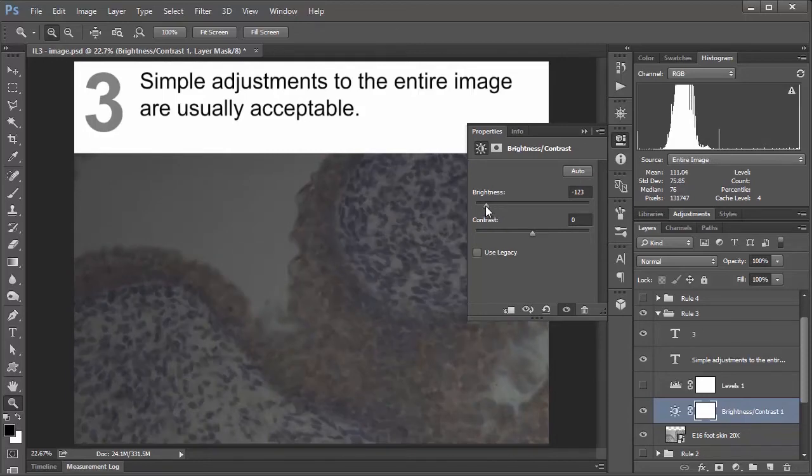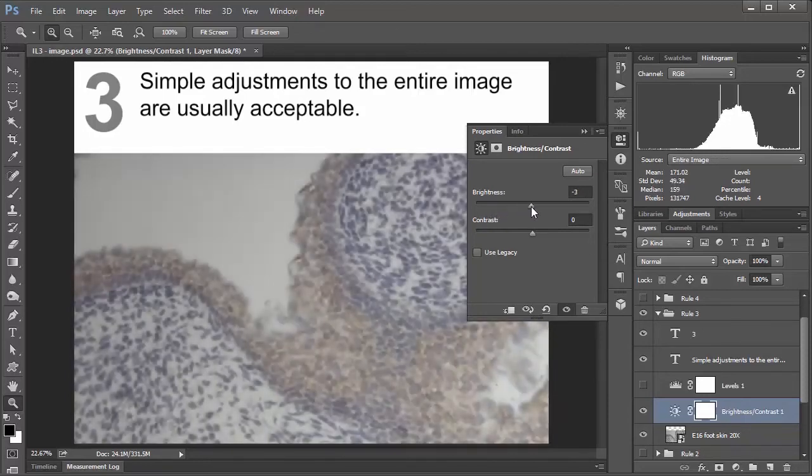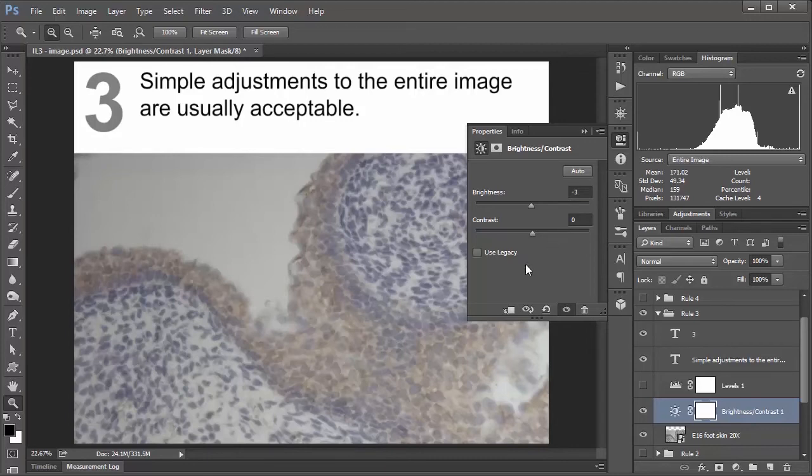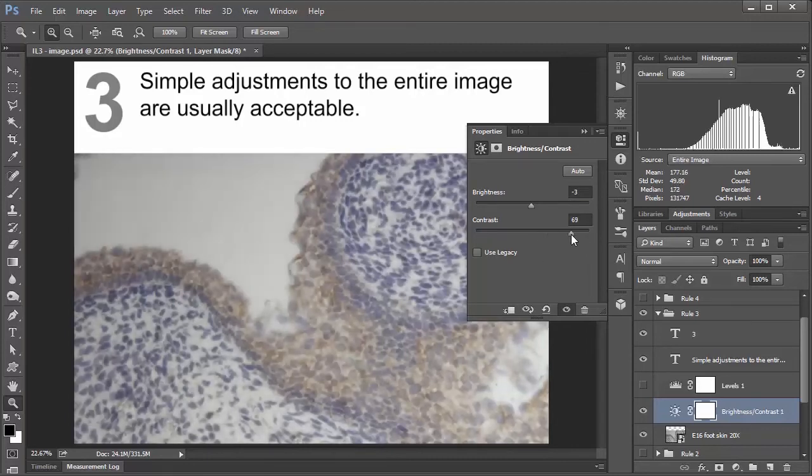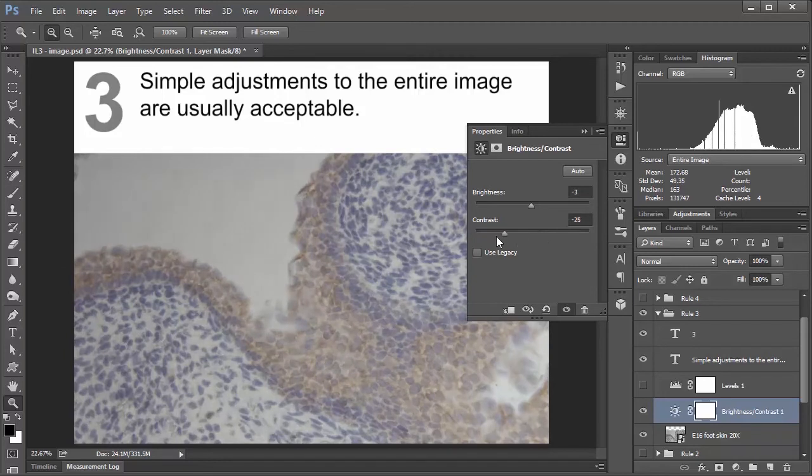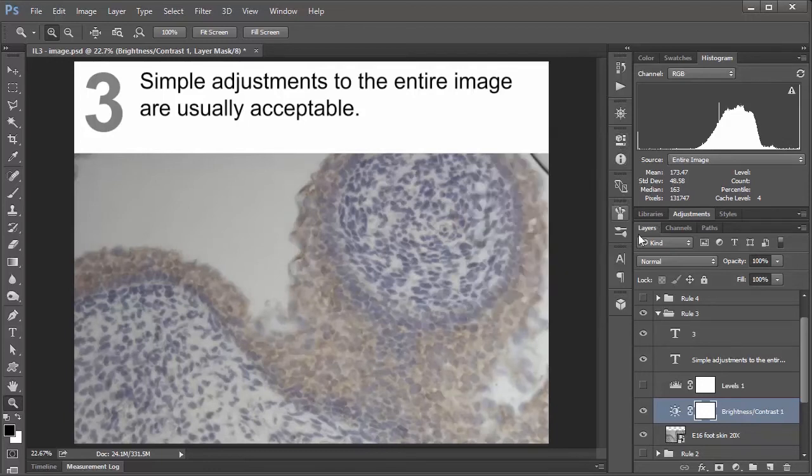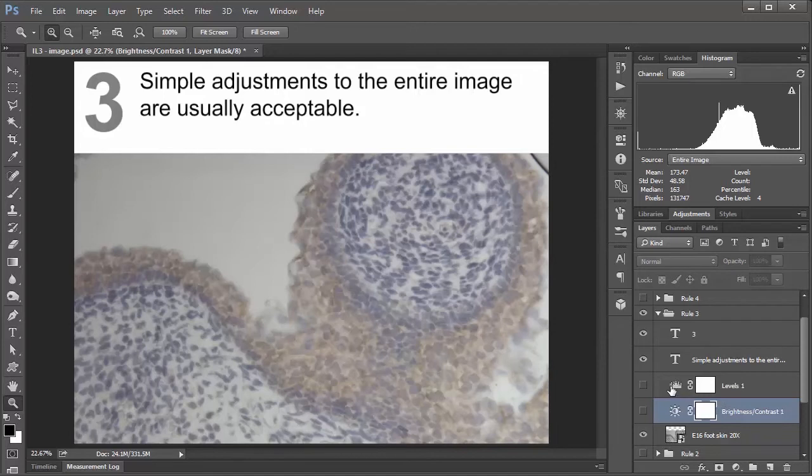But the important take home point is that this is a nonlinear change. And so like I alluded to earlier with rule number one, you don't want to be making changes or transforming your data in ways that are nonlinear. Or rather, if you're going to be applying a change, you want to make sure it's the same change to all your values. And in this case, that's not happening. Same with contrast. Again, you're stretching the histogram, but it's still kind of a nonlinear function. So if you're going to be using brightness contrast, you want to make sure that use legacy is checked.